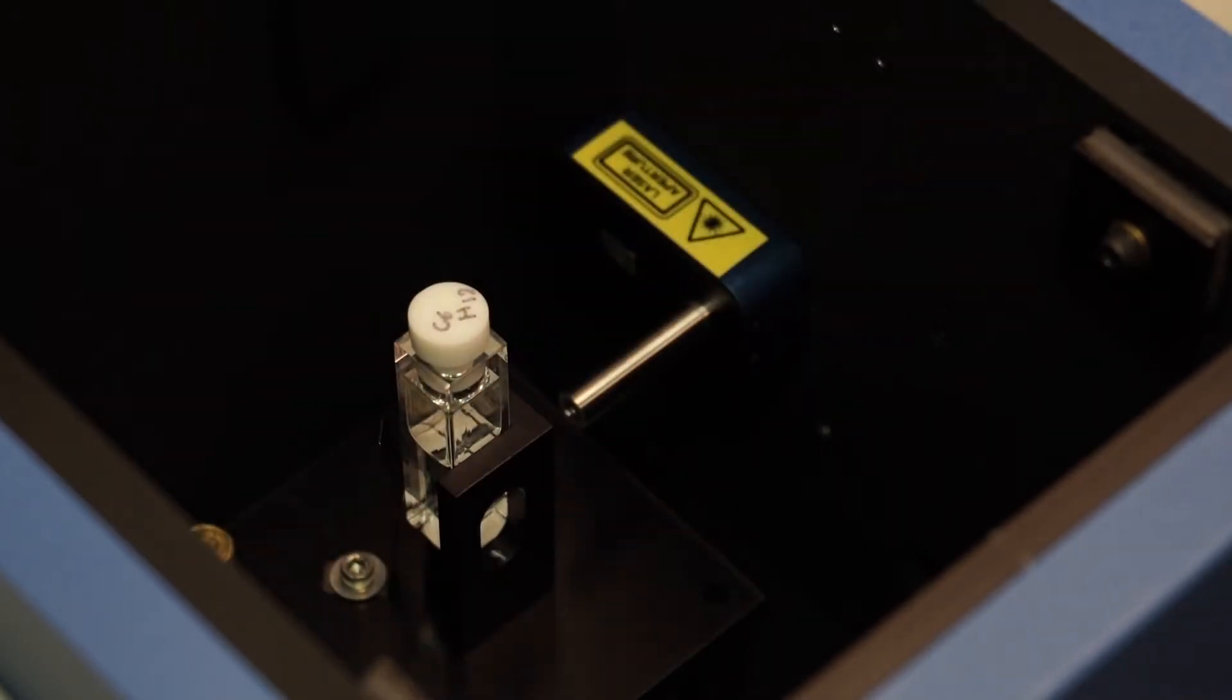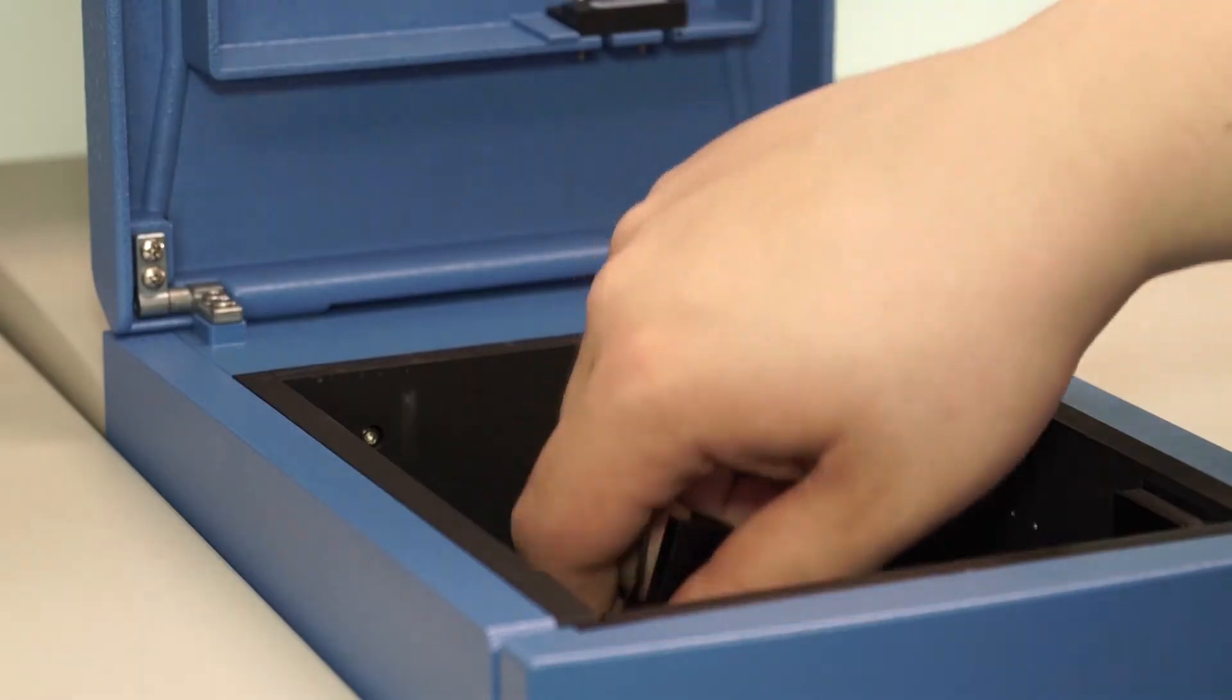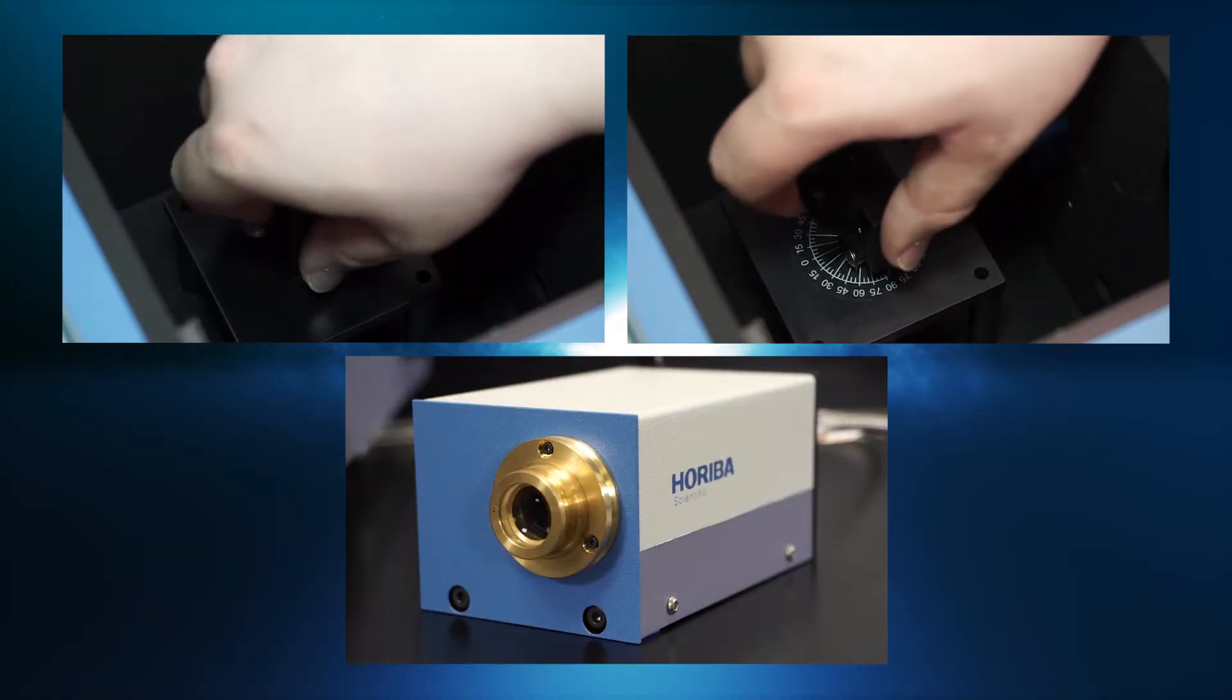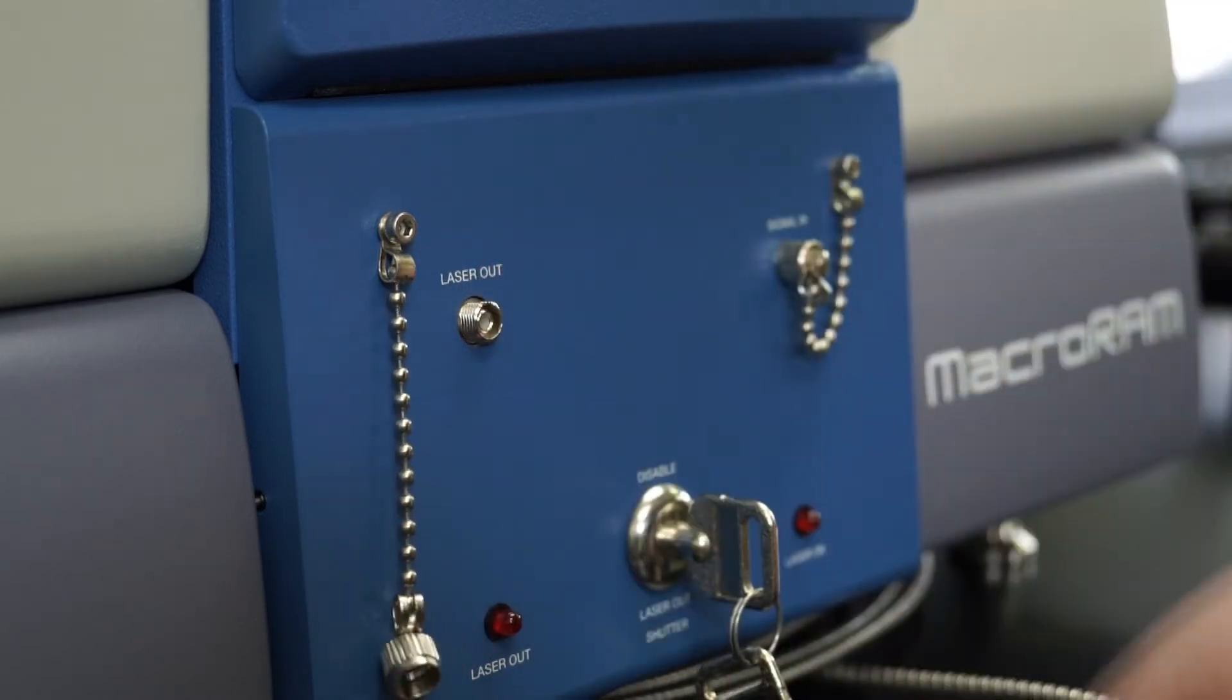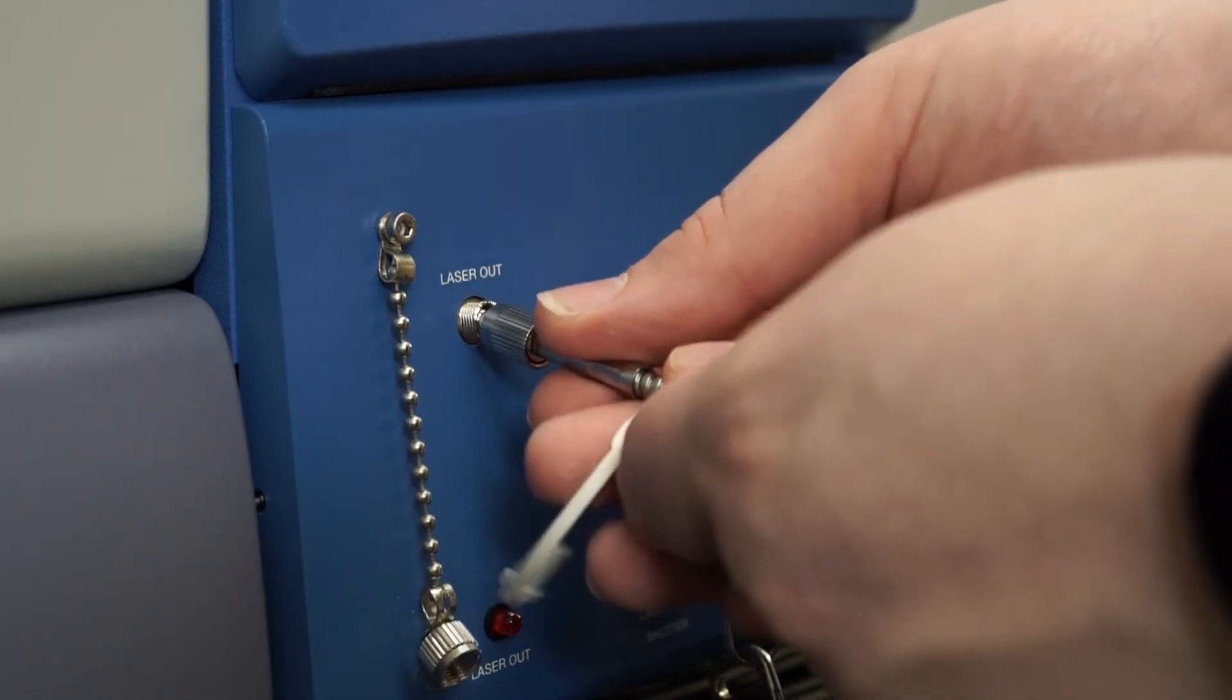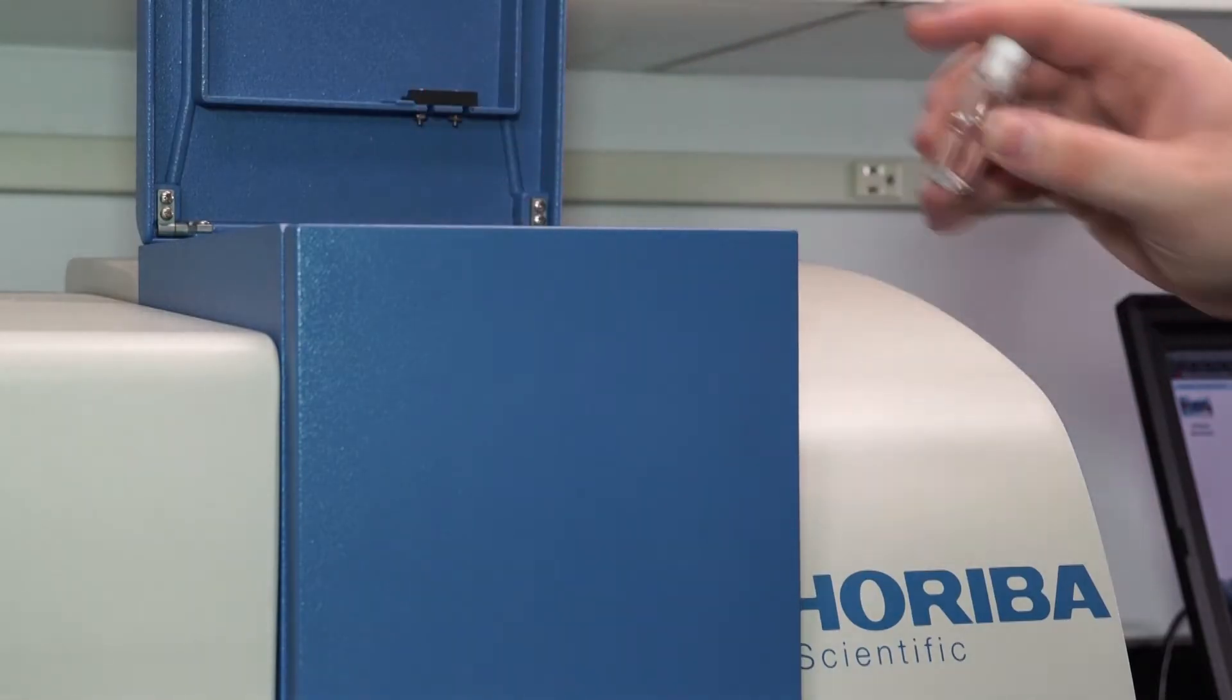The MacroRAM has the flexibility to meet almost any situation with an array of accessories. Move seamlessly from internal to external sampling. Just remove the sample.